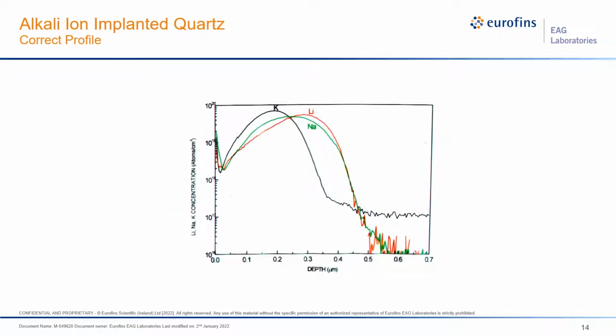It's even more difficult than the thin films. And when we apply the same conditions we've obtained in the thin films, we can find these sodium profiles dropping down sharply and not dragging on deep into the sample. So all these reference materials give us confidence that we can measure these mobile ions accurately, and we can use that for failure analysis. Why do I say that?